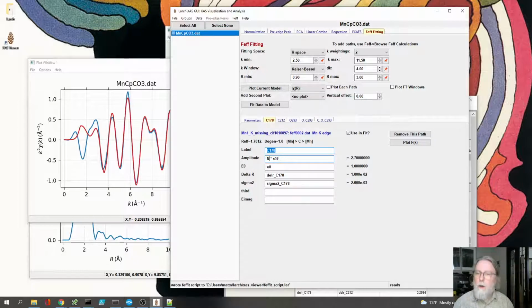Let's call this N, and I'll just give this a different name, N-carbonyl. That's for the carbonyl path. And this one's going to be N-ring. Again, the parameter names are not constrained to be these with the little path label. It's just that those are convenient. So here, these should all be N-carbonyl. Of course, I chose to spell carbonyl. Maybe I can do a copy and paste.